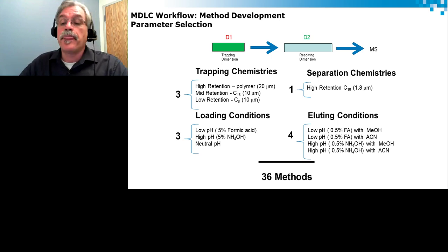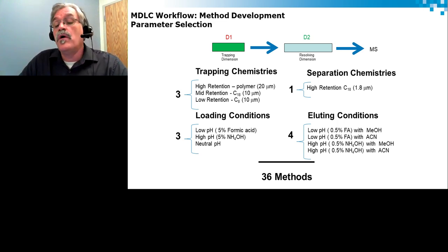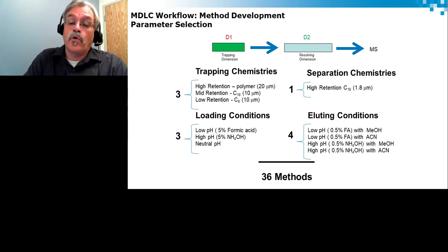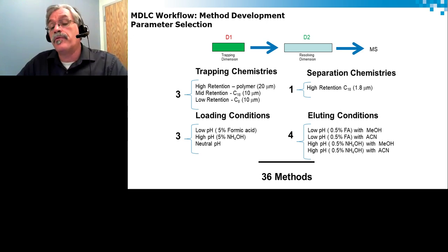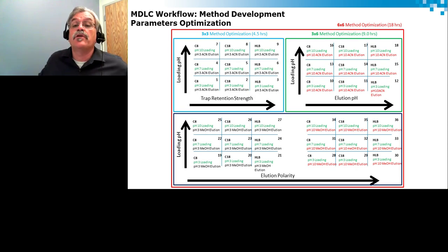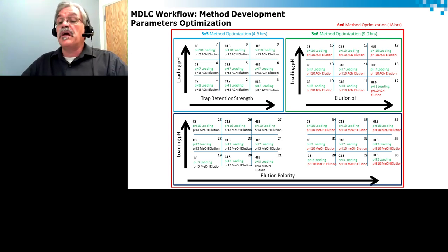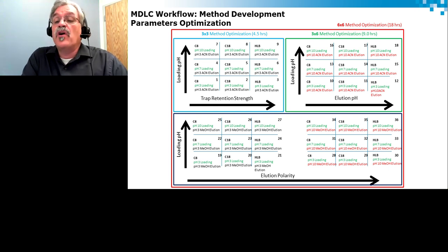Because sample prep is very complex and very lengthy, it becomes impossible to extract every single compound in a single dimension. Now, with multi-D, since the sample prep protocol can be downsized by a factor of at least 10, perhaps even more, we can spend a lot more time focusing on novel sample prep and optimize sample prep according to a target analyte's conditions. Let me explain. Here I've created what I call a method development scenario, where any system that we have can be automated to look at multiple target parameters, depending on how much time we can use.